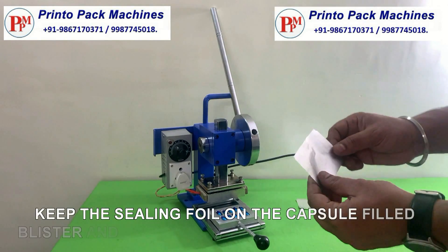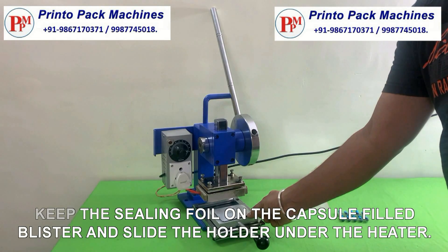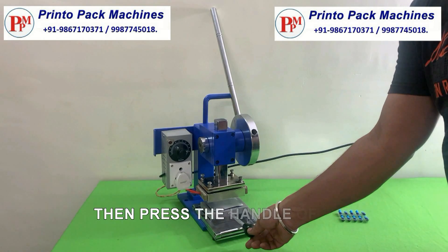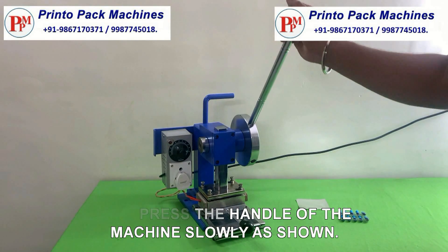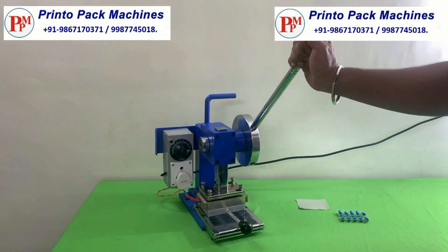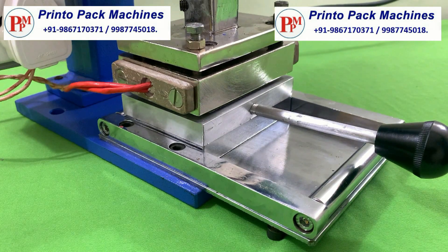Keep the sealing foil on the capsule filled blister and slide the holder under the heater. Then press the handle of the machine slowly as shown.